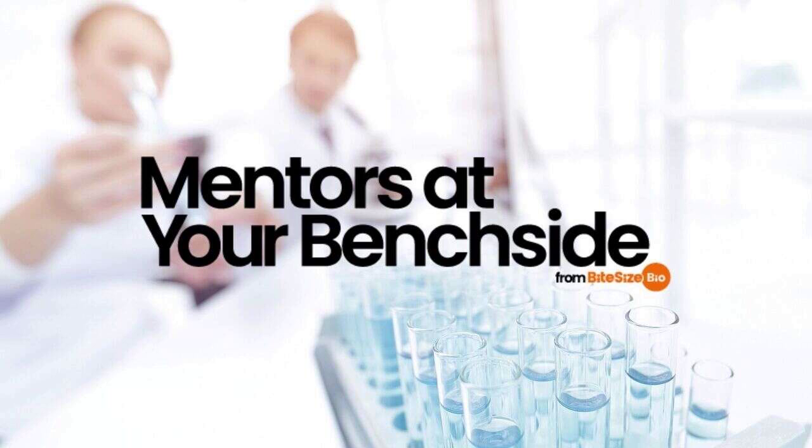As scientists, we're often told about the need for accuracy and precision in our measurements and experiments. If you work in a scientific environment, whether a pharmaceutical lab or a bioscience research institute, you'll likely make regular, extensive use of analytical balances. These precise lab instruments are highly sensitive and must weigh things with a high degree of accuracy.